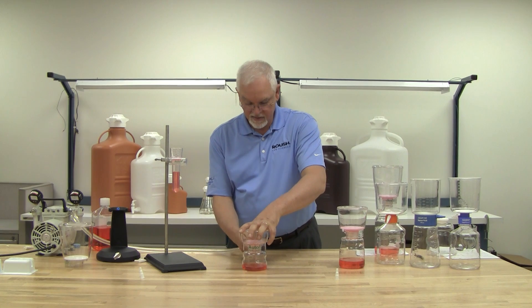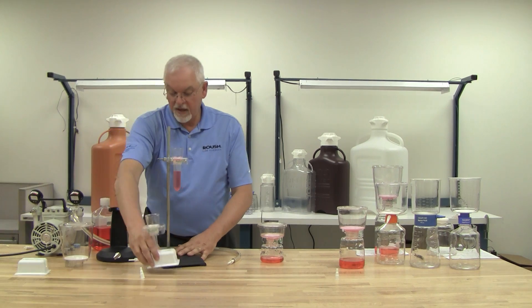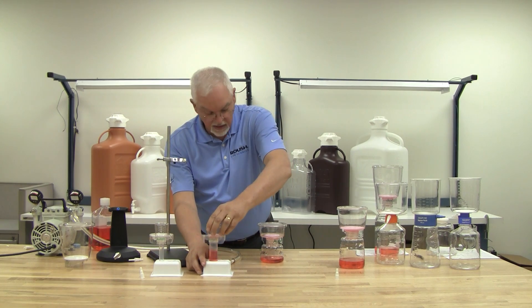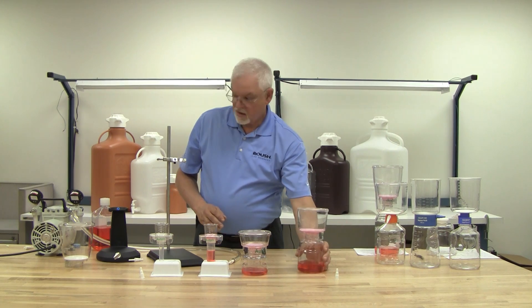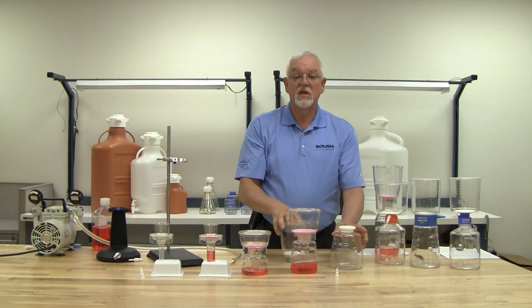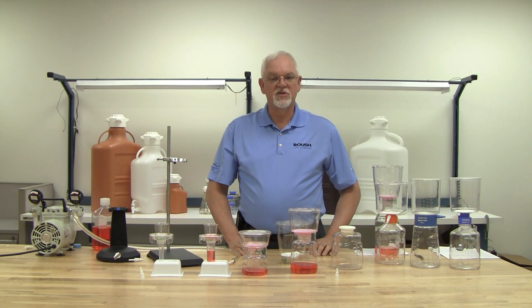So, there you have it. Let me tell you about our availability. We have 15 milliliters, 50 milliliters, 250, 500, and 1,000. This comes in three different pore sizes: 0.45, 0.22, and also 0.1. Thank you for your time.